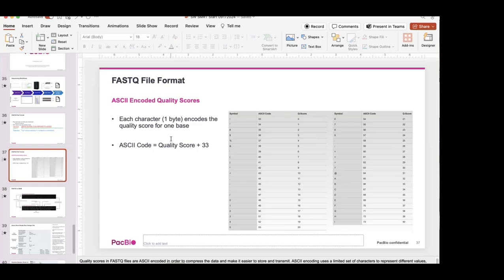And so there's going to be an ONSO update, or I think they're working on an ONSO update, to add that feature in so that you can generate the Illumina style FASTQ file names so that it can be plugged and played into existing short read pipelines that are expecting that Illumina file name. But it's not insurmountable. You could always just rename the file yourself manually to make it work. And not every pipeline requires that.